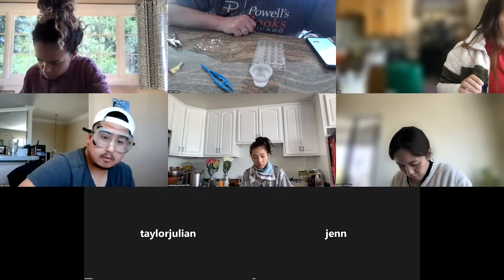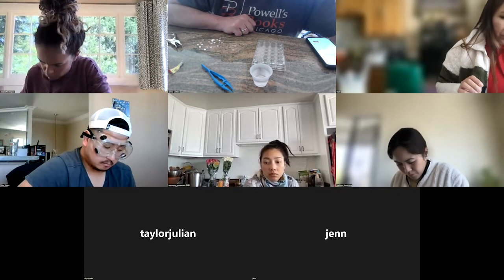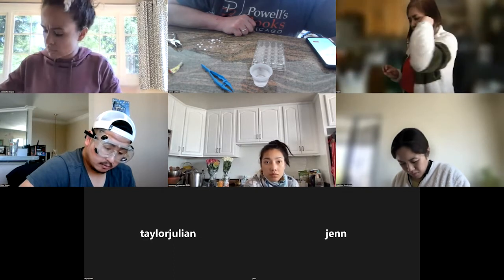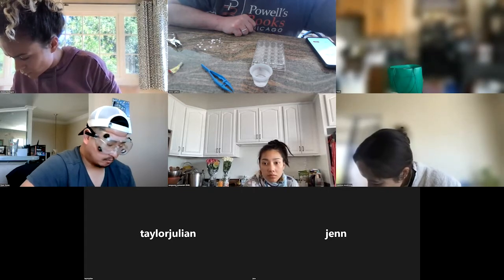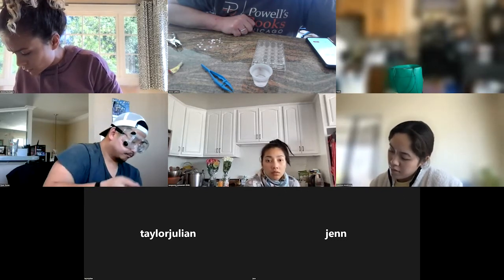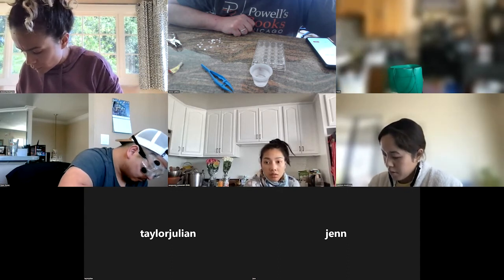What percent was that, Professor? 1.5% peroxide. So you dilute it 1 to 1, 10 mils of 3% peroxide and 10 mils of water. But I'm beginning to wonder why we needed to dilute it at all, since this is taking so long. Almost 4 minutes now and it has not moved.